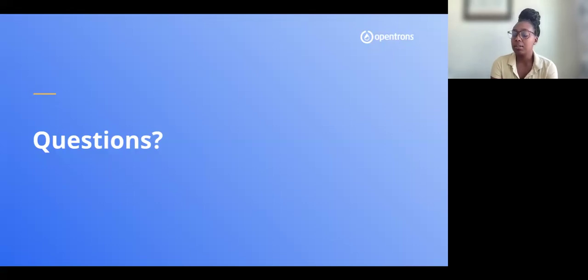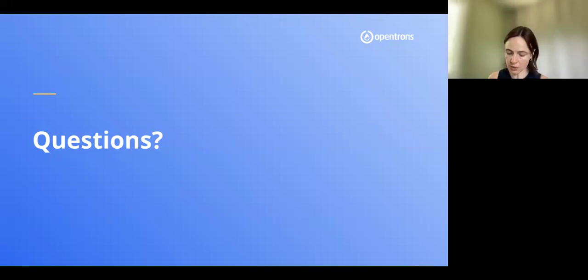And for single cell, yes, we're really excited. We are developing single cell sequencing applications in particular on the Flex right now. Perfect. As a note to Ricardo, who asked that question, we'll follow up with the spheroid content after the call.